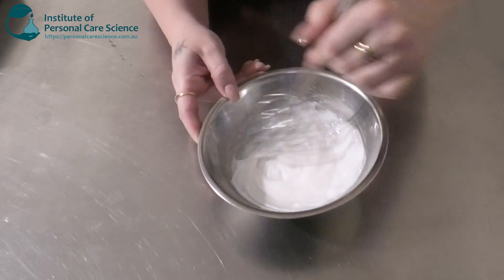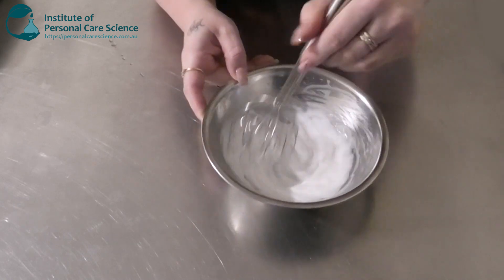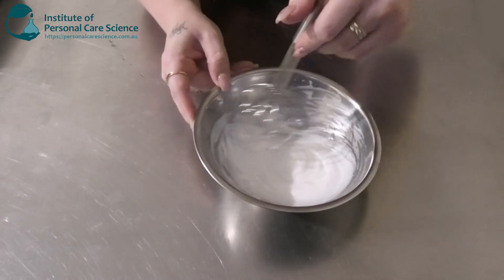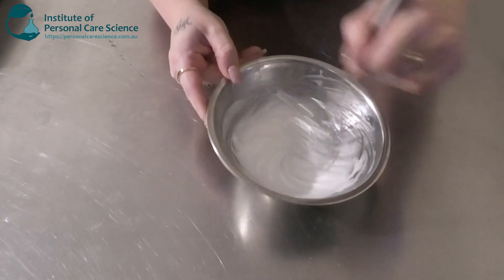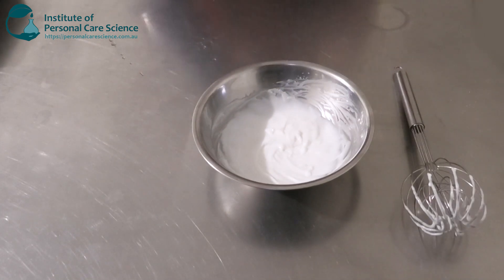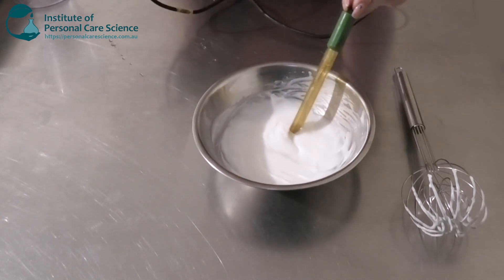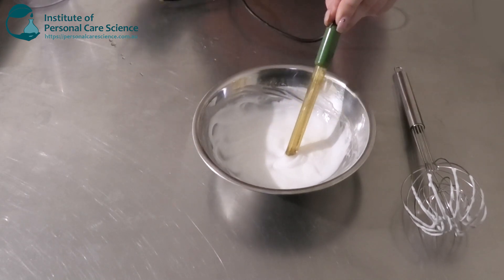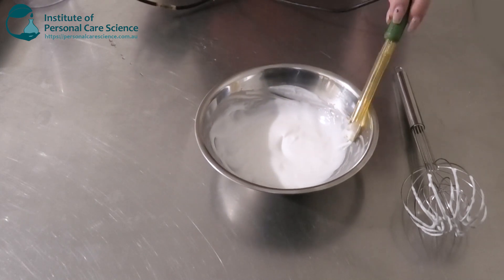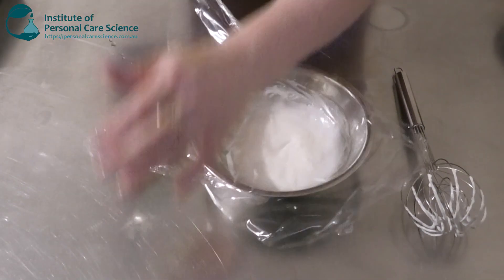Now it's looking like a nice beautiful viscous cream. We will assess the final viscosity the next day as well — we'll allow it to sit overnight to check for any signs of instability. Now I'm just going to check our final pH. We're not going to adjust it; we're just going to check it and see if it's sitting at around 6 to 6.5. And that's about 6.3, so that's pretty much where we want it to be.